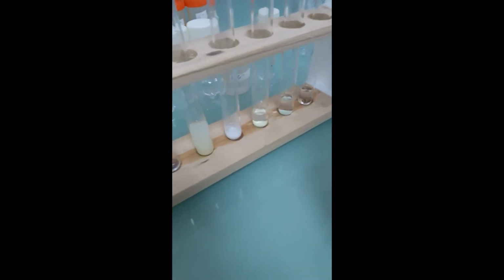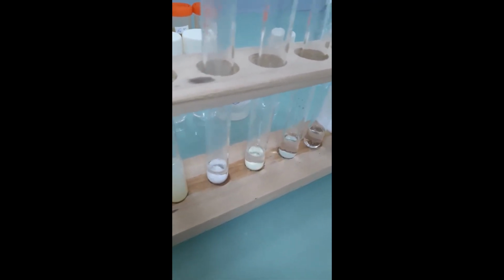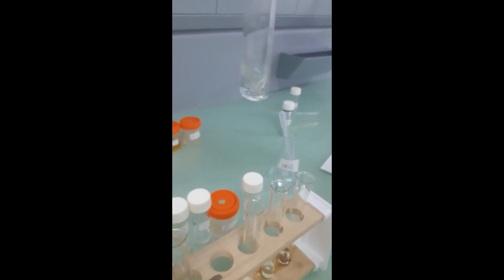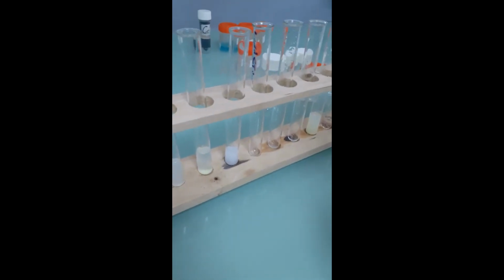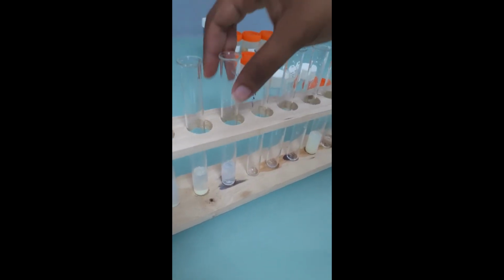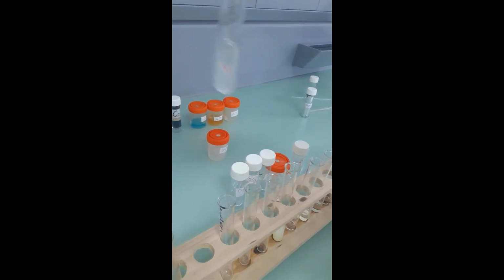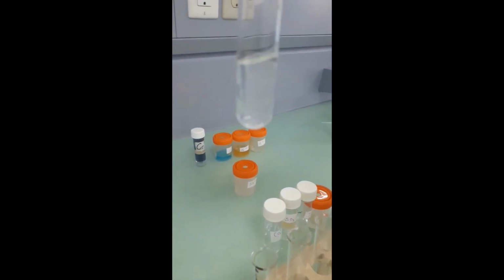To the first part we're going to add ammonia solution. To the second part we're going to add nitric acid. There you have it. That's for your SO3 2-.